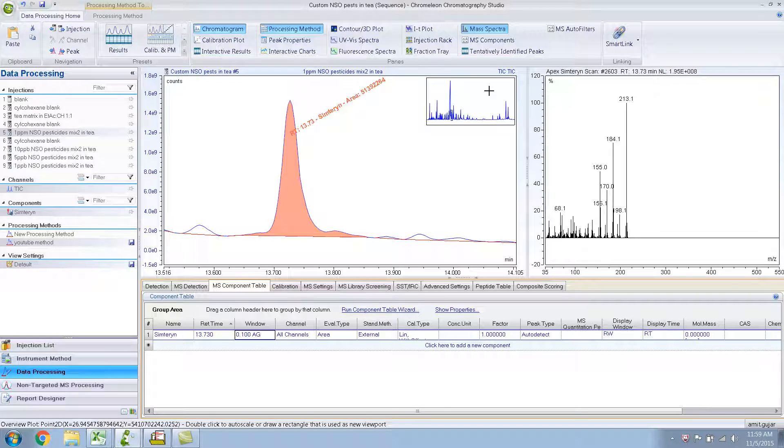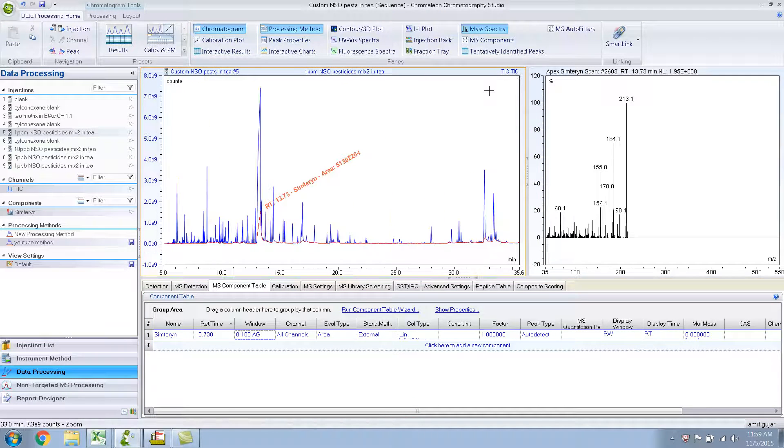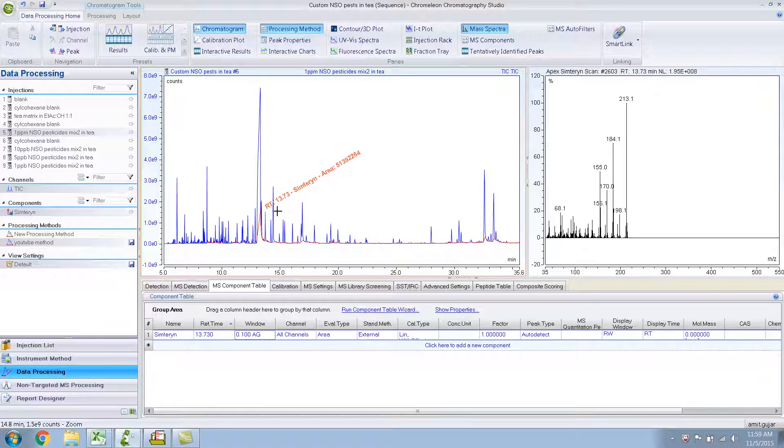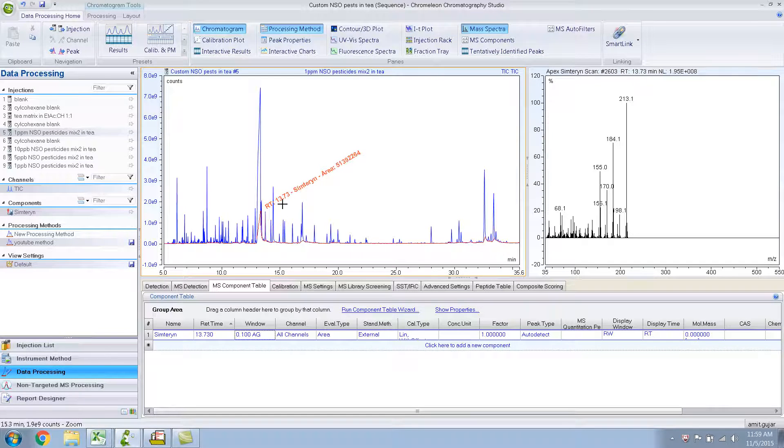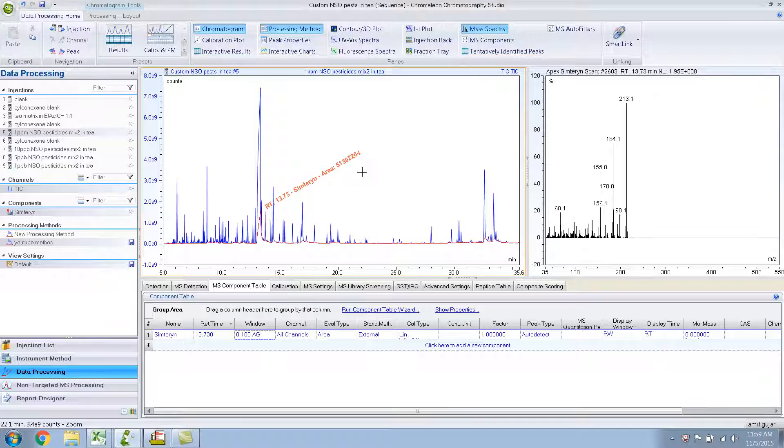Let me just zoom out so you can see. So this is how you label the peaks. Let me stop the video now.